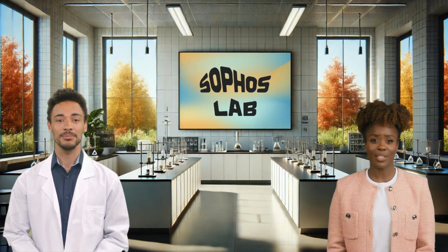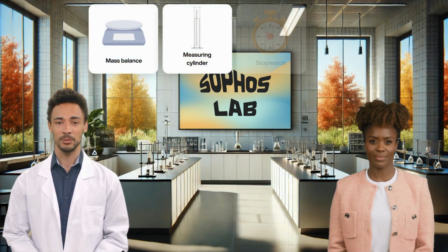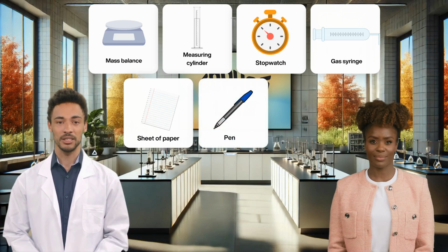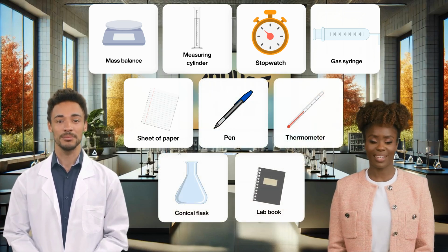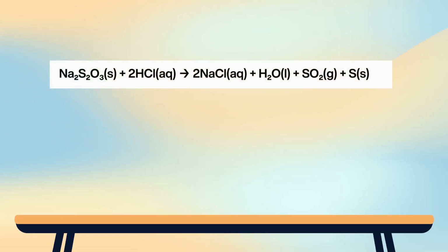Let's start by gathering our materials. Sam, what do we need? So for this practical, we need a mass balance, a measuring cylinder, a stopwatch, a gas syringe, a sheet of paper, a pen, a thermometer, a conical flask, and a lab book. Let's get started. Make sure your lab area is tidy and all your materials are within easy reach.